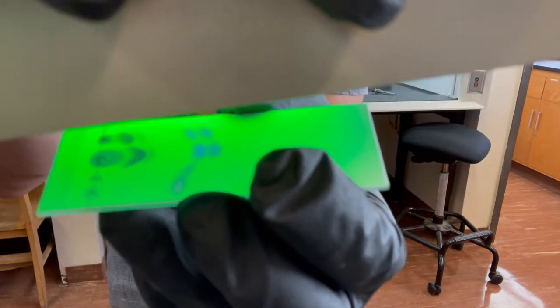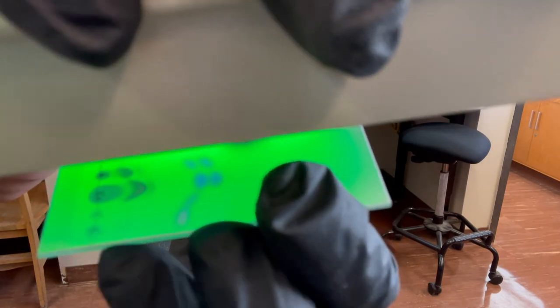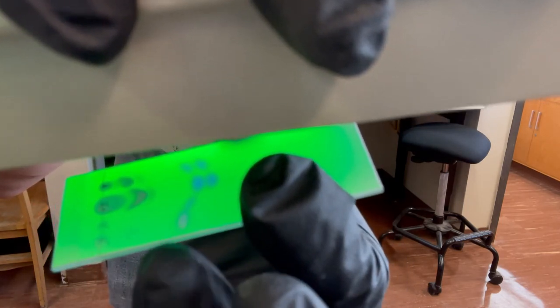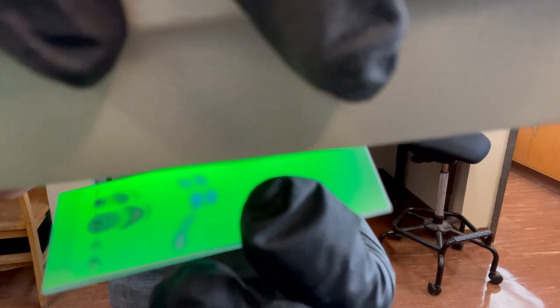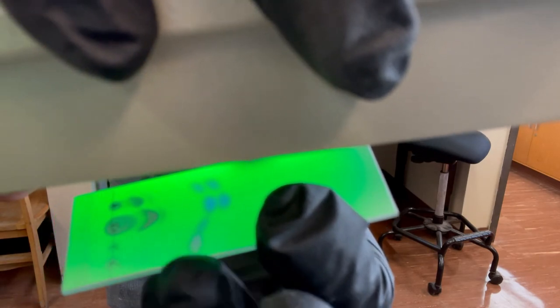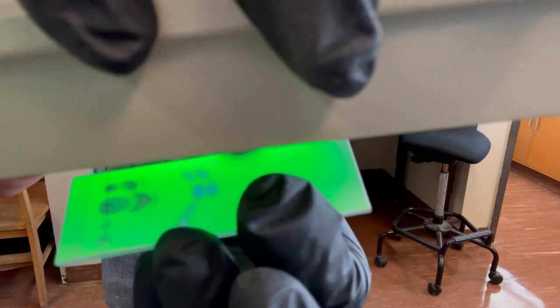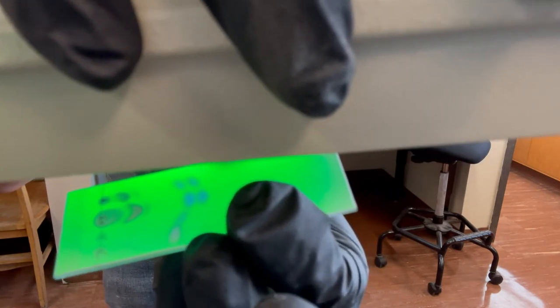Unfortunately, when the liquid started to go up, it looked like it was a little slanted for whatever reason. Perhaps that's why you have that slant in the samples. Every spot, like these ones right here, the lower RF value, those should be equal. And the other two should probably be around the same as these bottoms. So all the bottom ones in the midpoint should be the same-ish, and the top ones should be their own as well.